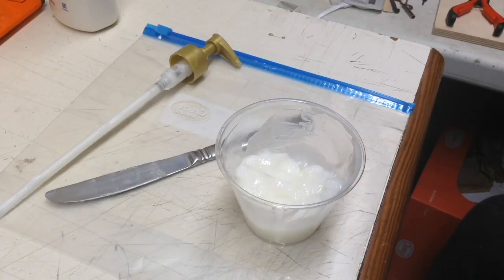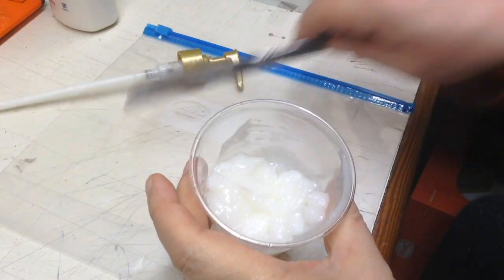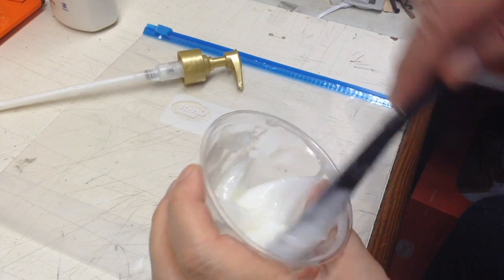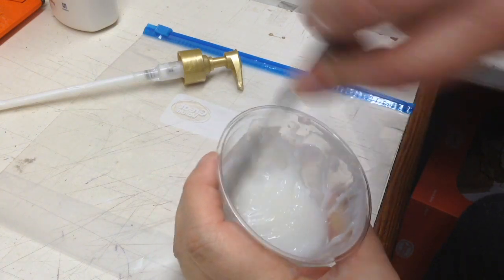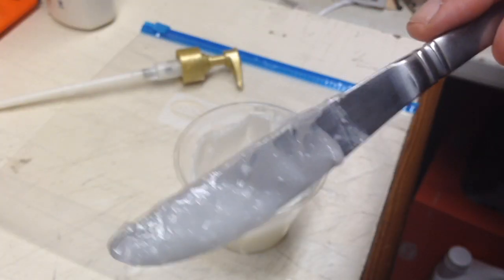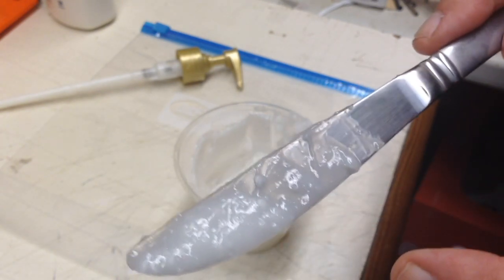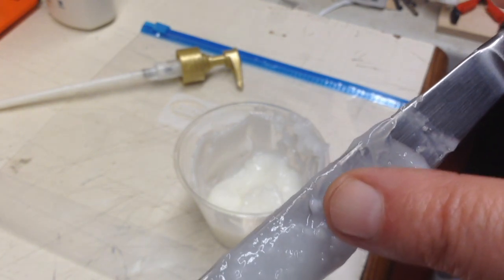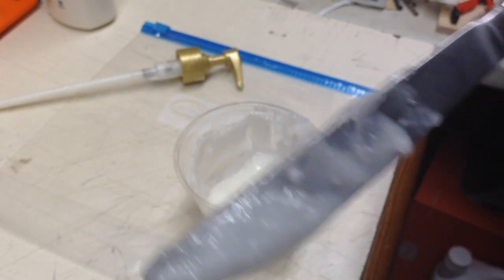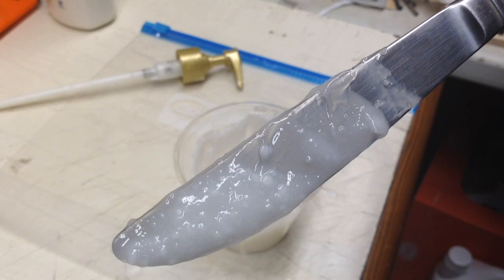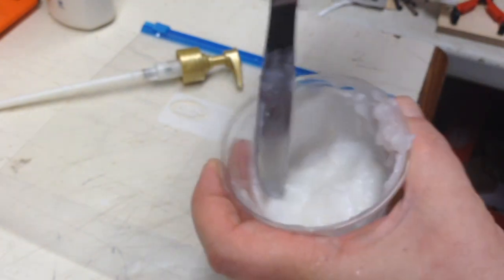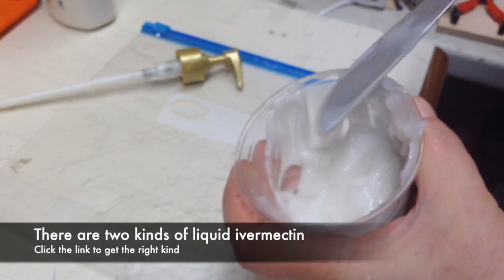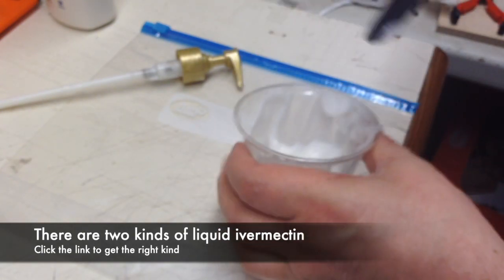I've been stirring this for about five minutes or so. What seems to work nicely is to mush it against the side like this over and over because you can see little bits of white lotion, little lumps. So if you smush that against the side like that, it tends to mix with the liquid.